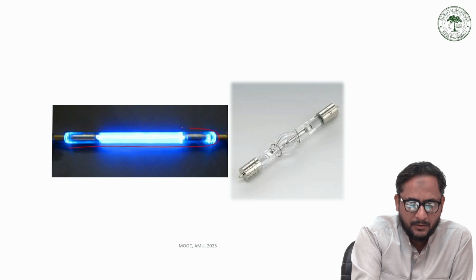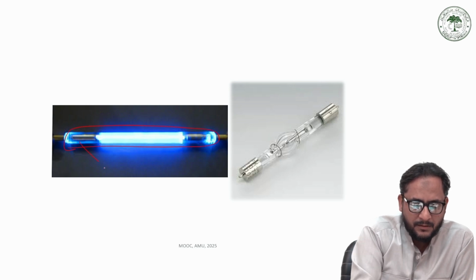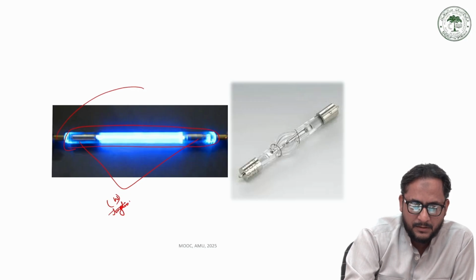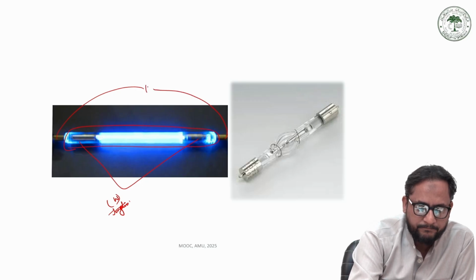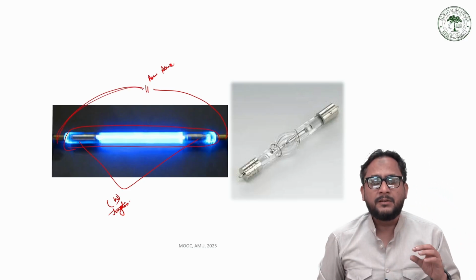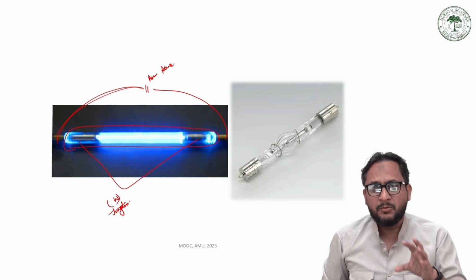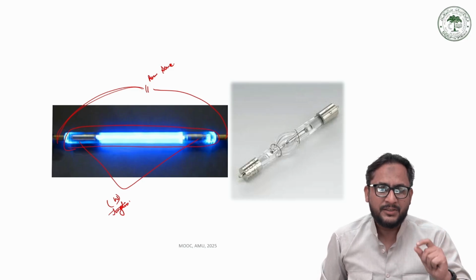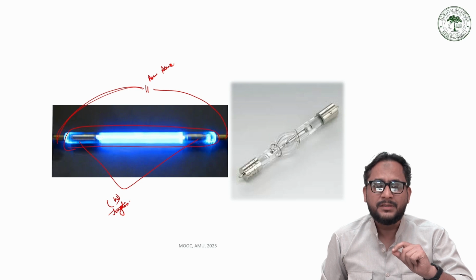A quite narrow tube is there, and we have two electrodes. Again, these electrodes are made up of tungsten, and they are connected to the power source. When the power switch is on, electric voltage is applied and a bright momentary light is generated, which causes excitation of the analyte molecules in the sample.